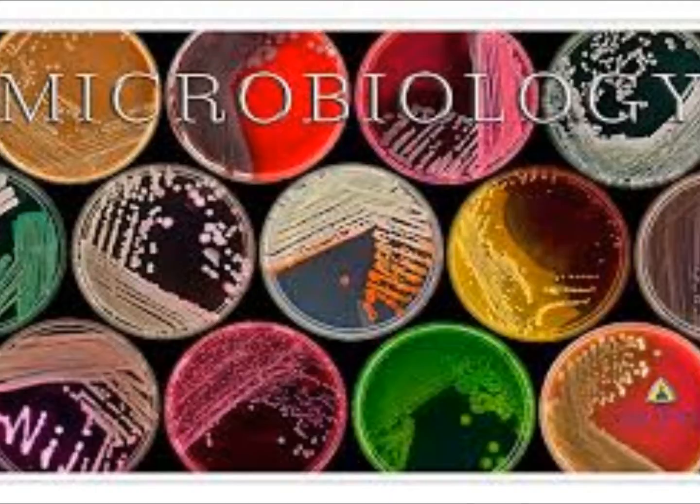So if you just put C in there, who's got the Candida, no growth? Hey Jean, on the CNA, she just said put growth but no growth, right? Yep. Nothing else. BAP is where you do the descriptors. Now, you have a little more on MacConkey because it's differential. You gotta say LF or NLF besides the growth, if it does grow. So no growth on that.